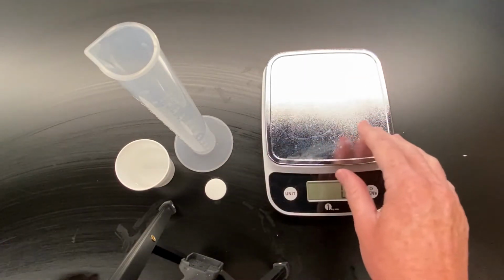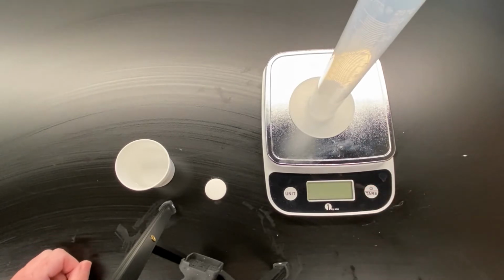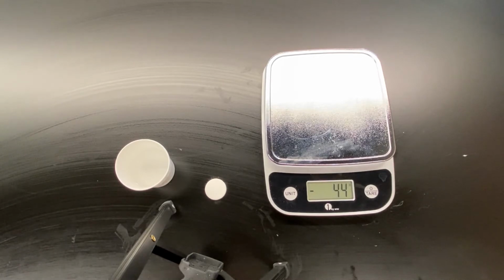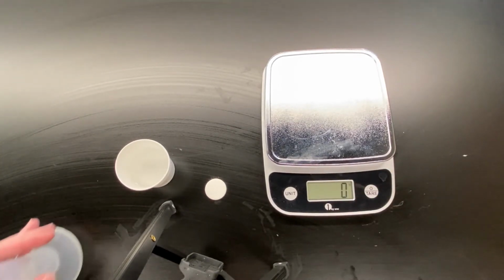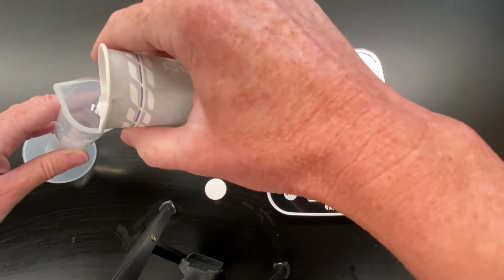If you put things onto your balance and then turn it on, it freaks out and it gives you like negative 44 when you take it off. So if it has weird numbers on it, then you need to push the start button again to make it zero. All right, you're going to pour 20 milliliters of water into your graduated cylinder.